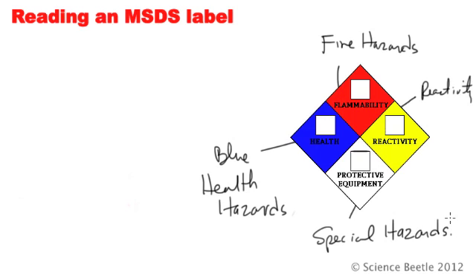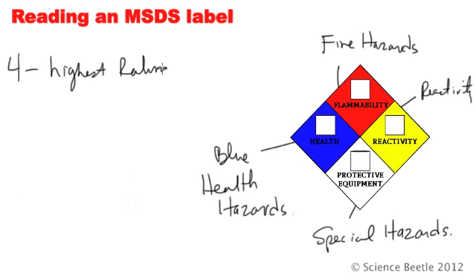We are going to break this lesson into several parts. The first part gives you a general overview of what the MSDS label is and how to read it. When you look at the label, there are four numbers that can go into each of the boxes — anything from a zero, one, two, three, or four. On this scale, four is usually going to be the most severe and highest rating for that particular color category.